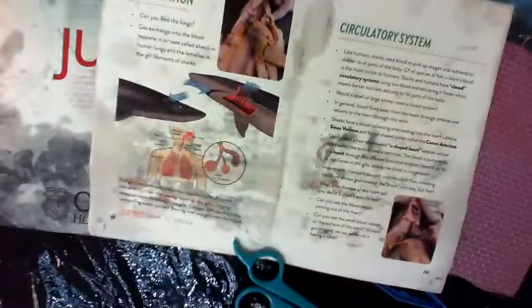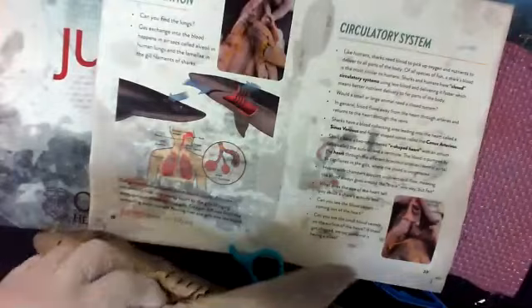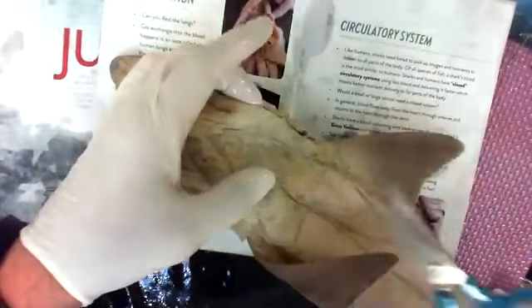So respiration, the respiratory system, which is the lungs and the airway, and the cardiovascular system are technically both combined to be the circulatory system because you're trying to circulate things through the body. You're circulating air into the lungs, oxygen gets into the blood and then moves it along. So we're going to look at the rest of our cardiovascular.